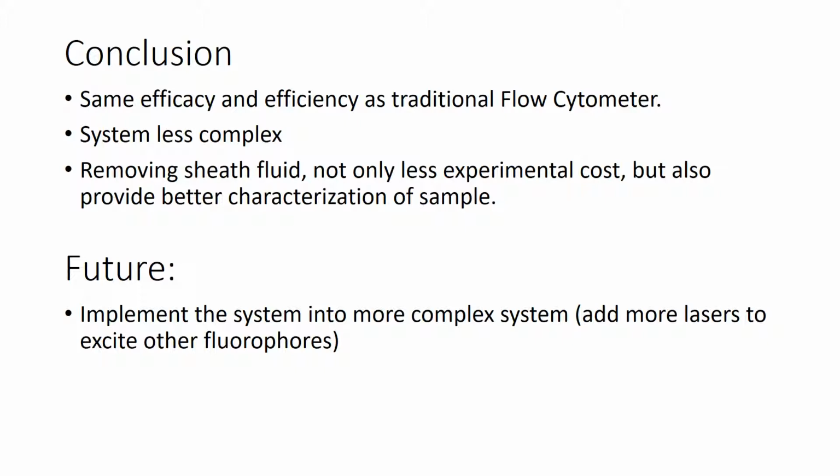By removing the sheath fluid, not only is the experimental cost decreased, but it also provides a better characterization of the sample. Because in traditional flow cytometry, reanalysis of the sample is impractical because the sample is diluted 100-fold by sheath fluid with each successive analysis.